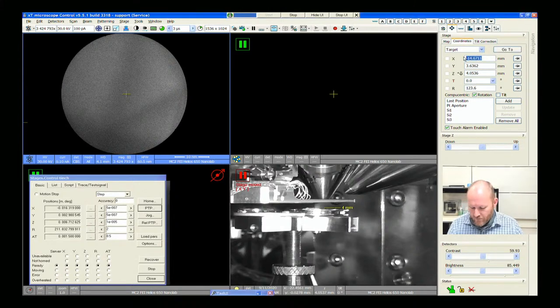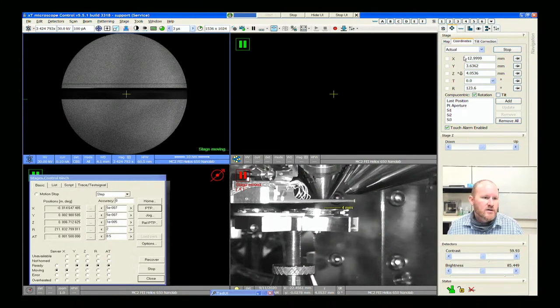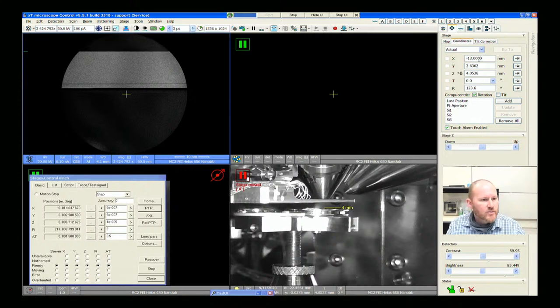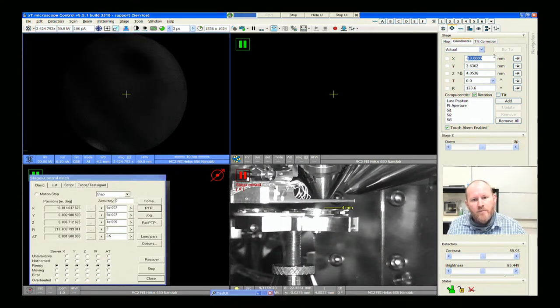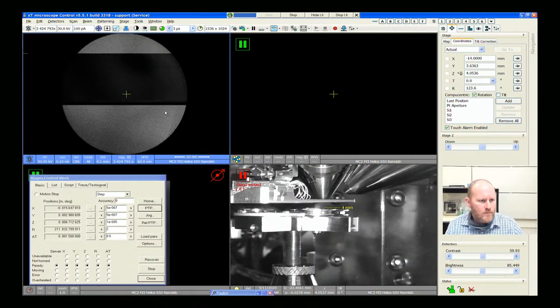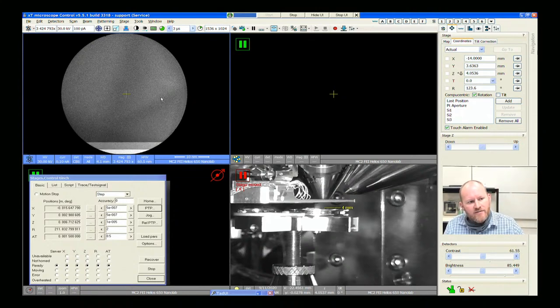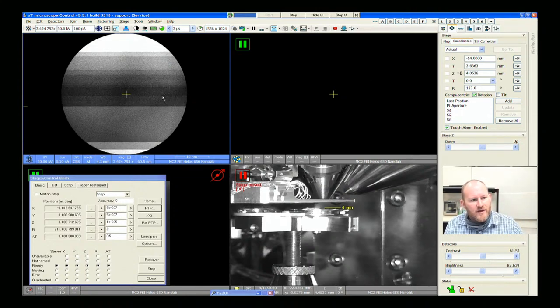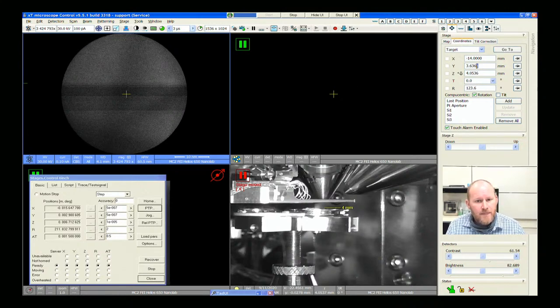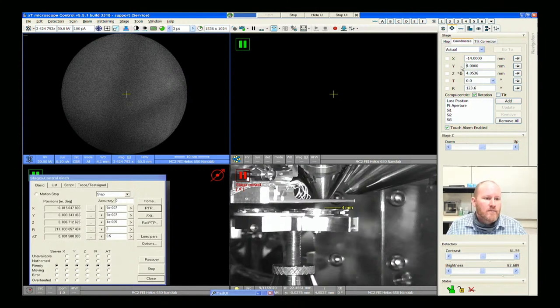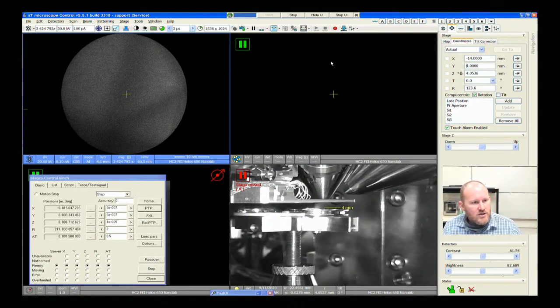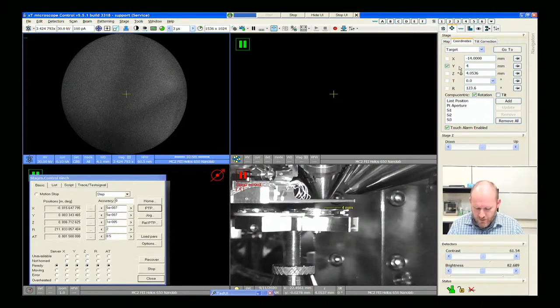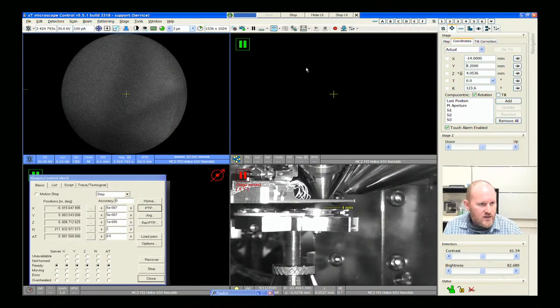I can type in values here if I want — let me move a millimeter in one direction. That took me right off the sample. One thing you'll notice, though, is that as I'm moving this stage the patterns that we're seeing aren't changing, which we expect because the orientation of a single crystal is the same everywhere.